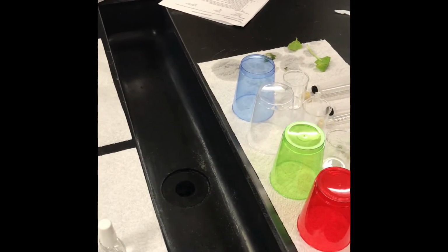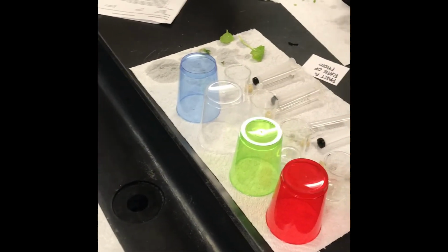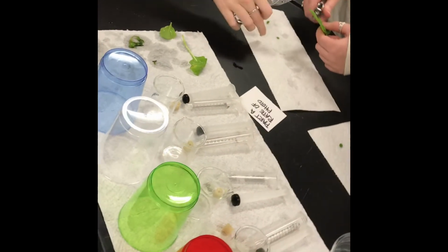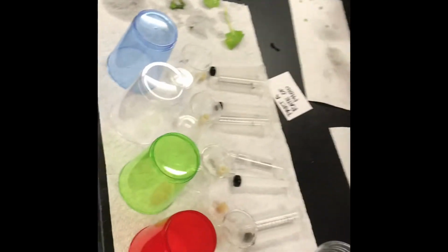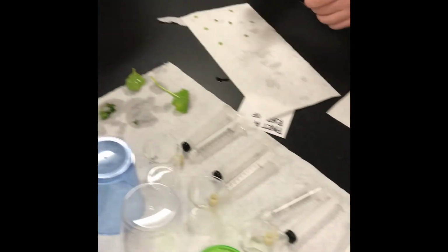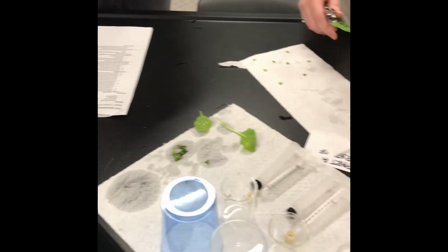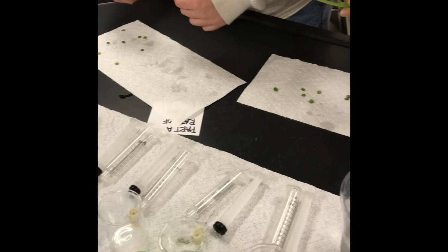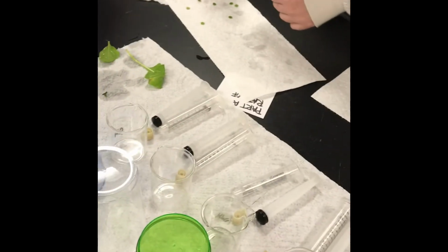This is me. Okay, so we're starting part A of the AP Photosynthesis Lab. And you can see all the materials that are lined up. We've got some colored cups, we have syringes, we've got a bicarbonate solution, and then we've got kids that are already starting to cut out leaf chads out of the spinach leaves. So they need 15 chads per setup, so it's going to take a little while to do this.